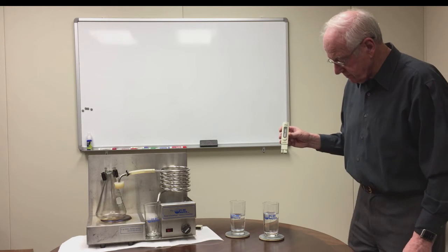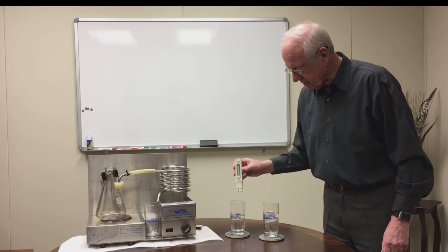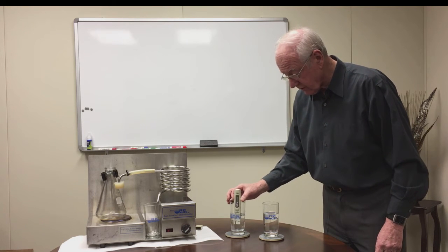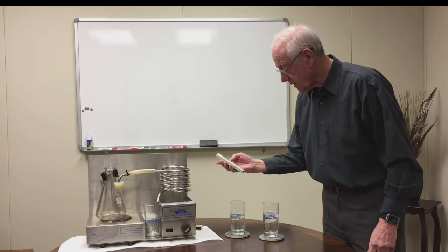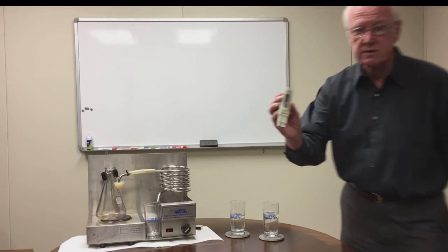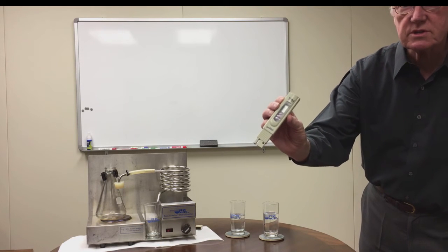The first thing I'm going to do is put this into distilled water — I won't know if it truly is distilled water until we read it. And lo and behold, there's the reading: zero zero zero.